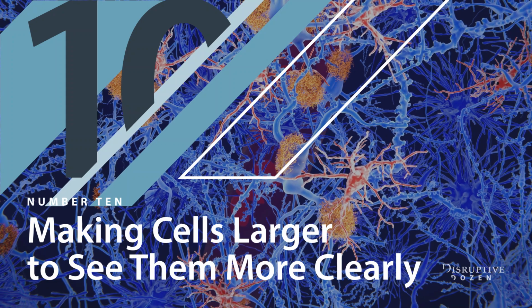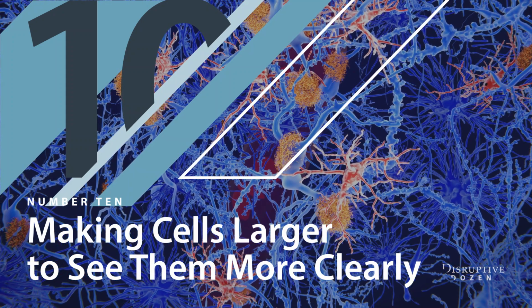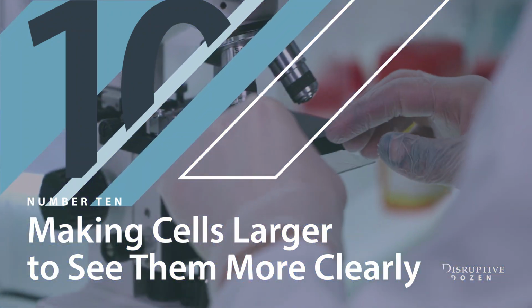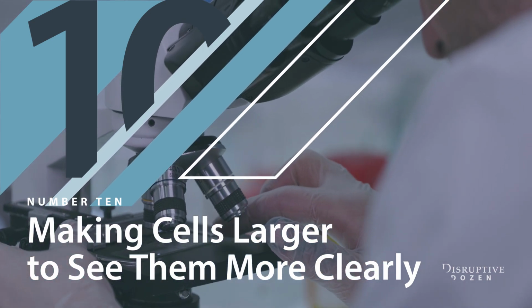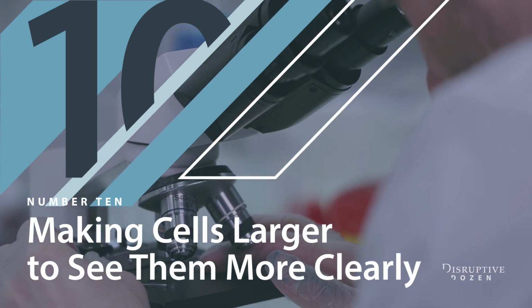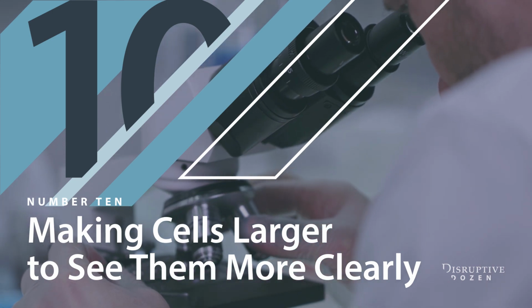By marrying expansion microscopy with other state-of-the-art imaging methods, the Massachusetts-based team, together with their colleagues, achieved what previously could be done only with high-powered, expensive microscopes. They also visualized millions of neuronal connections in just a few days, enabling large-scale brain mapping studies that would otherwise take years to complete. Expansion microscopy is making inroads in the clinic, too.